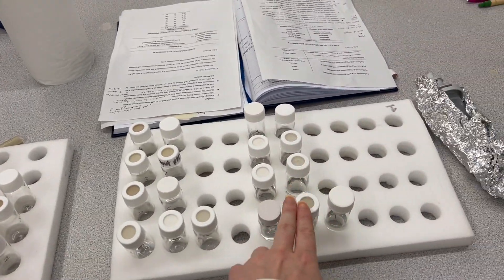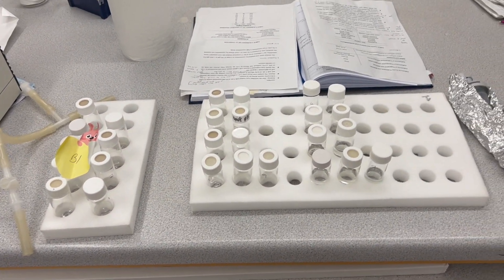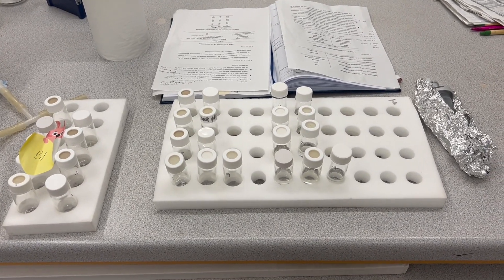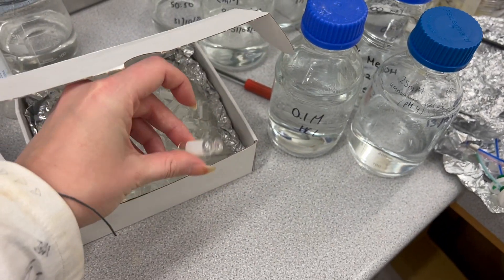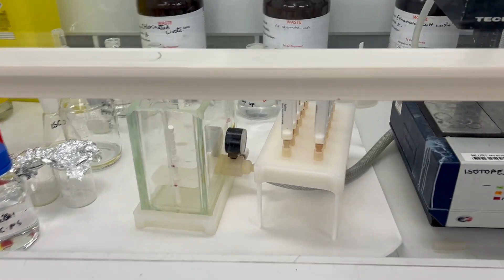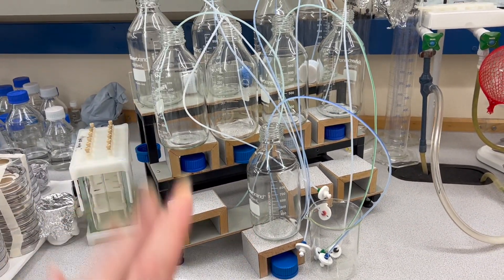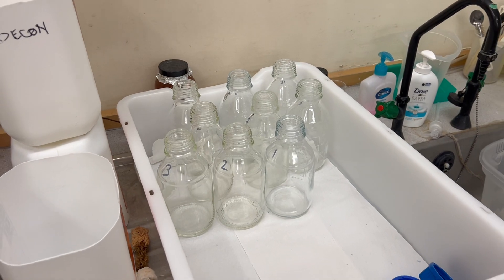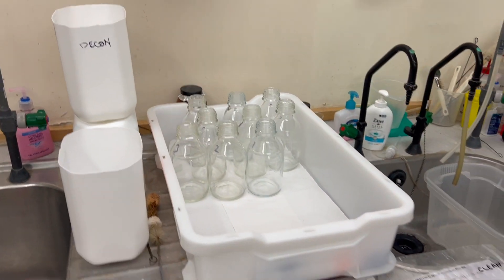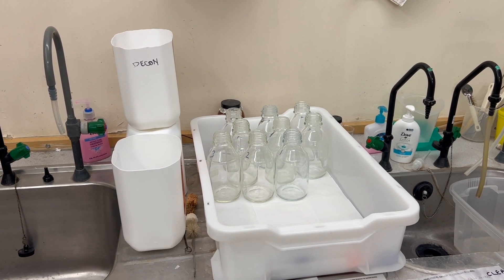These two are already dried down, so I just need to dry down these ones and then I need to reconstitute them. I need to add a known volume of solvent — I'll add one mil to all of them and then I can transfer them to LCMS vials ready for LCMS analysis. I also need to tidy away the SPE cartridges from yesterday and all of these bottles from the SPE. I'll give them all a rinse out and pop them in here so they will go off to the wash bay where Anne, our designated wash bay lady, will put them through the dishwasher.